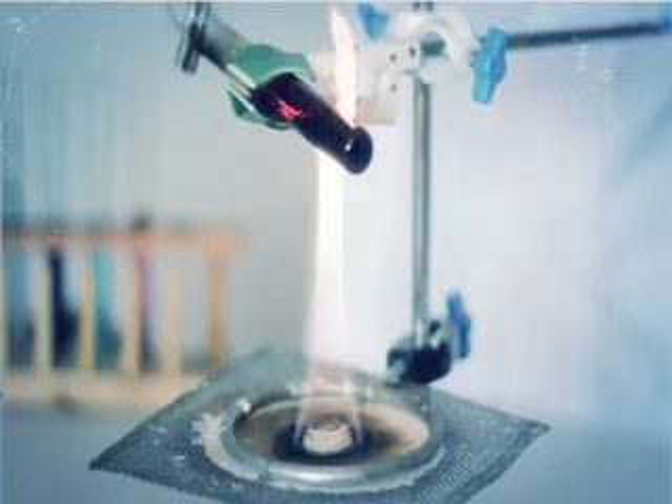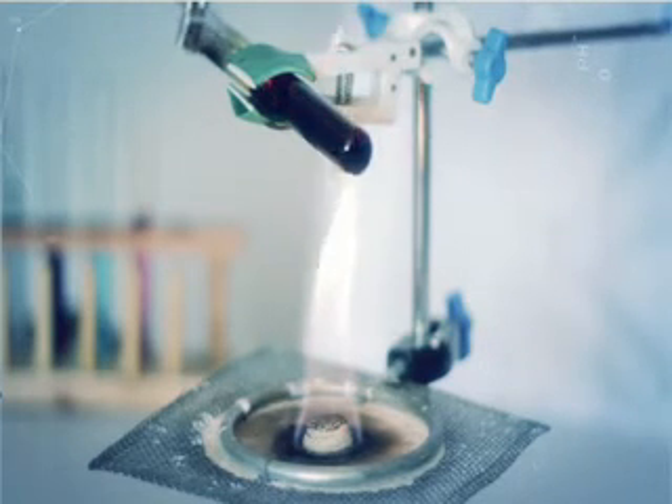Проволочки раскалятся с красного до желтого цвета и сгорят в парах серы. Останется черный сульфид меди.